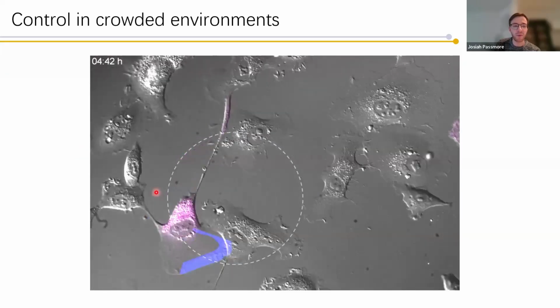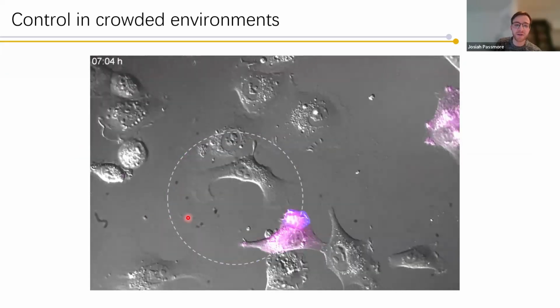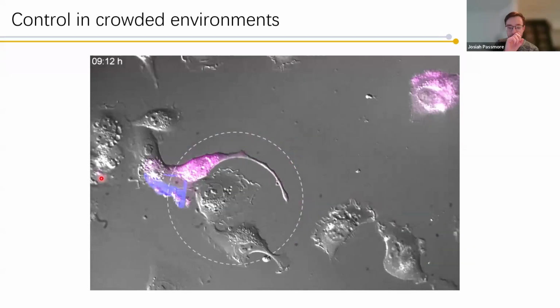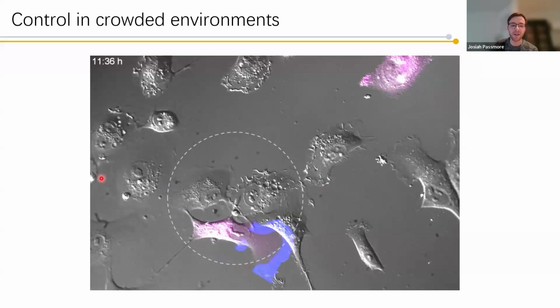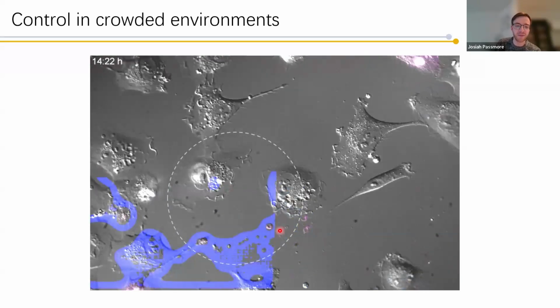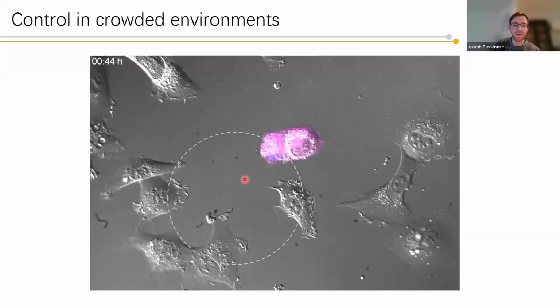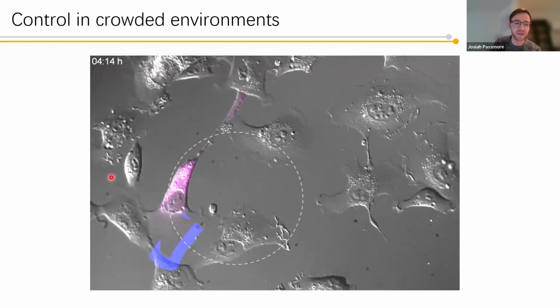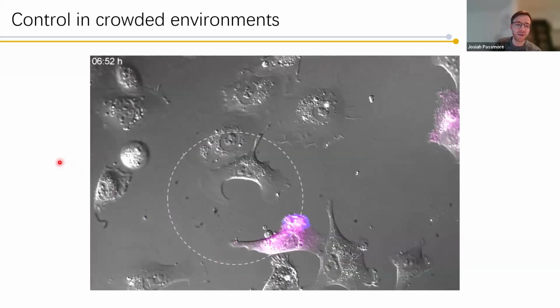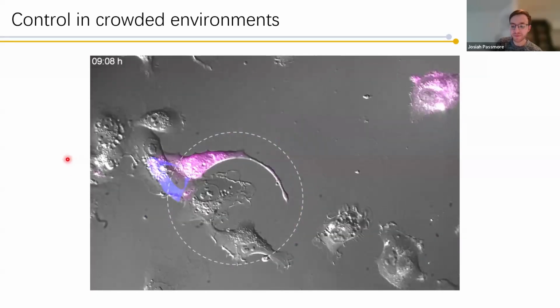They're quite sticky and they pull out bits of membrane, and you can really use this to investigate how cell-to-cell interaction affects cell migration, particularly in the directed cell migration phase. You see here that sometimes the cell is not so happy with it, and then it ended up being dragged away by another cell. It also can lead to some interesting movies.